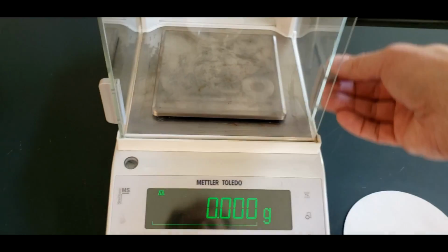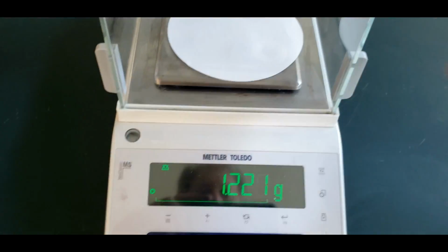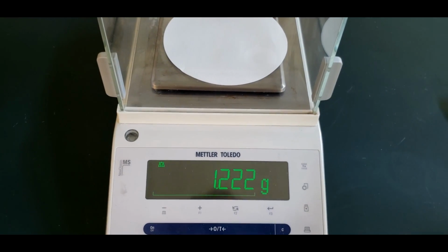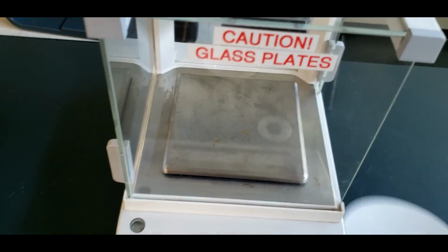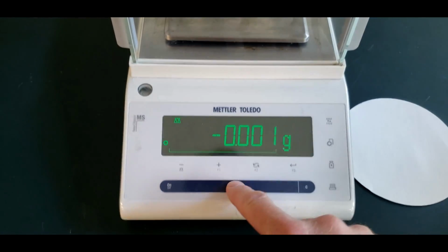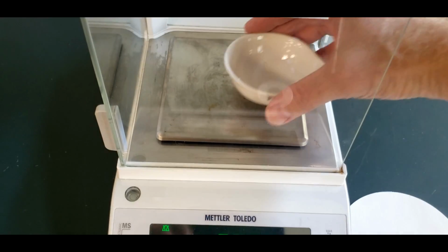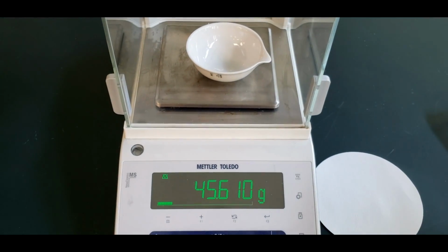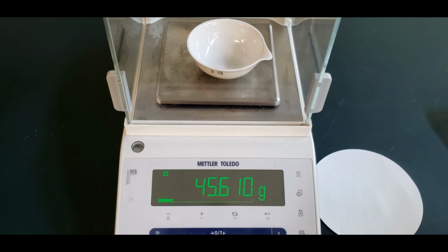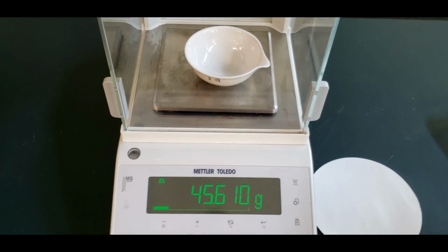Next, we're to weigh a piece of filter paper. 1.222 grams. And then we need to weigh an evaporating dish. It's 45.610 grams. So those are two masses we have to add into our report sheet.